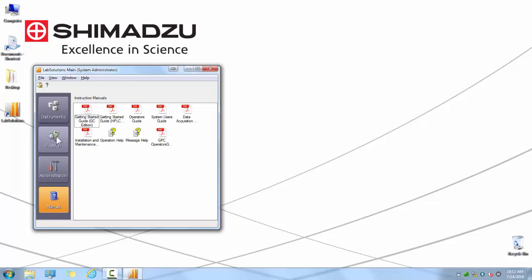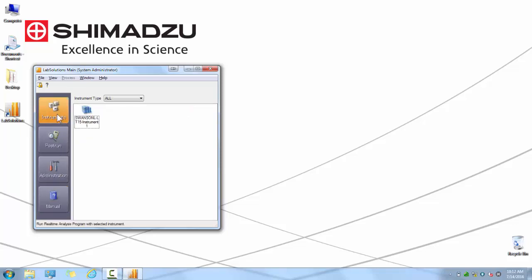By default, when you first launch the software, you will see a single instrument icon with your PC's name associated with it. You can begin by double clicking on this icon and configuring a new instrument from it, but for the sake of this video, we are going to enter a new instrument from the beginning.